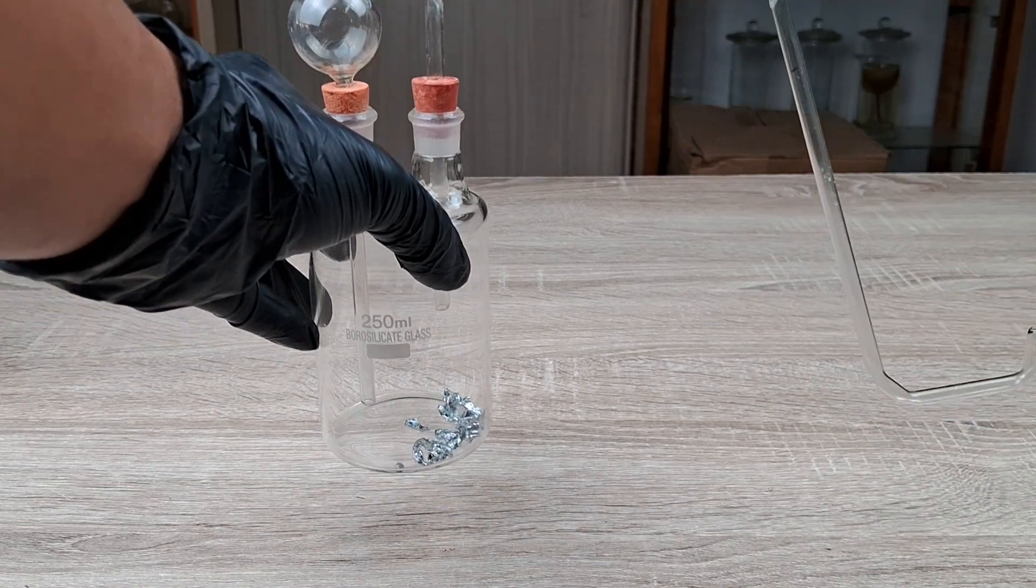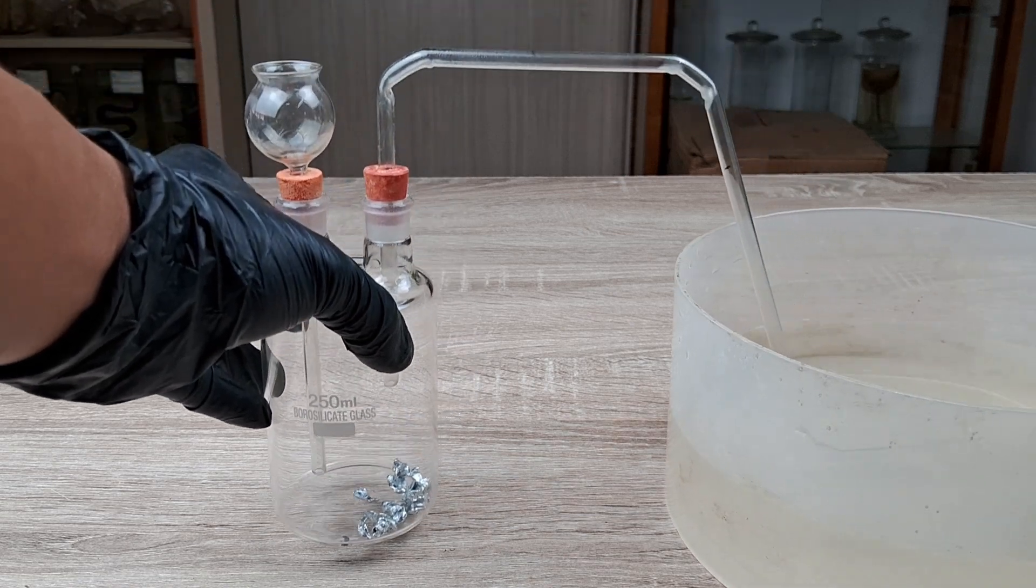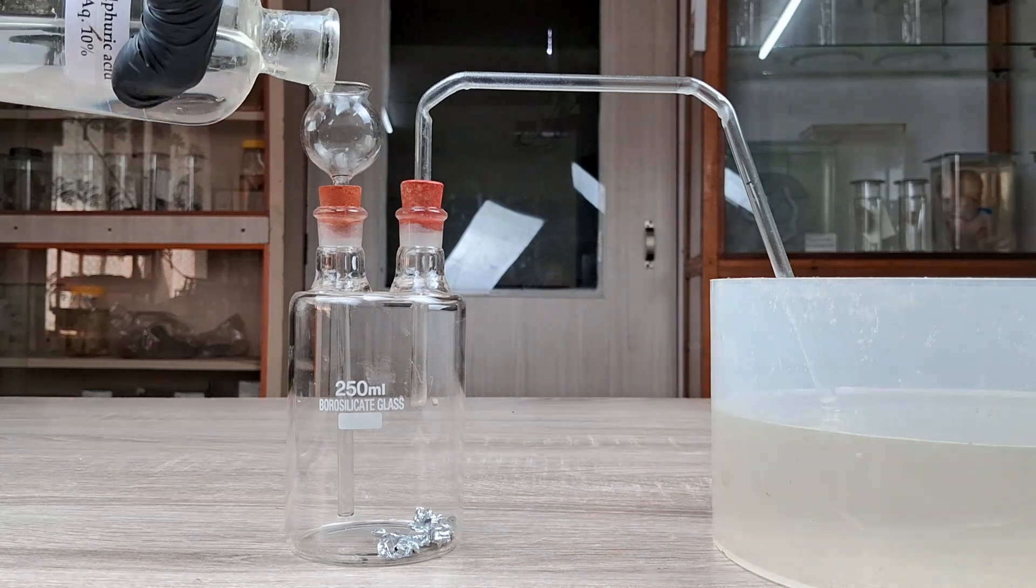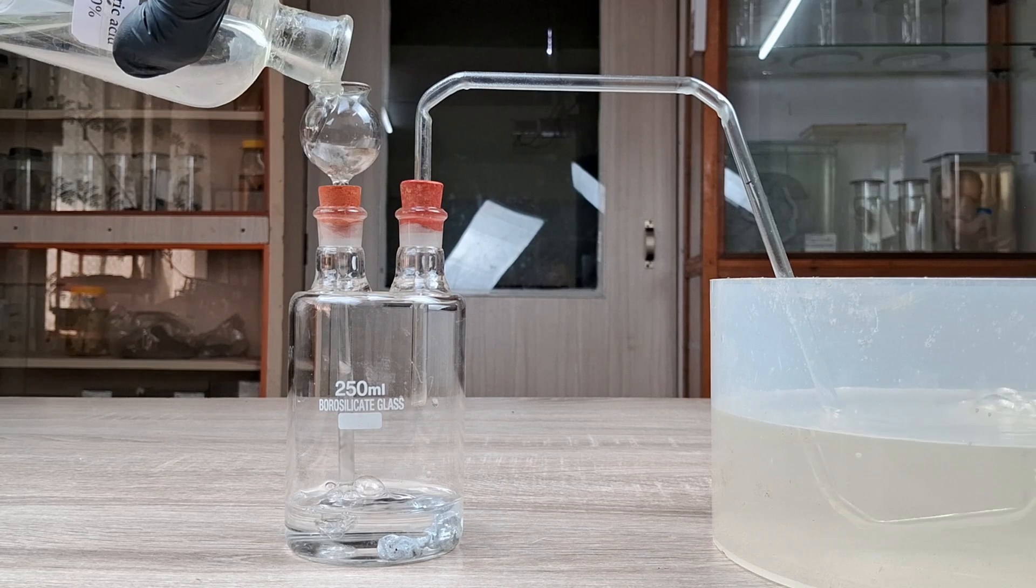Immerse the free end of the delivery tube into the water contained in the trough or beaker. Now, carefully pour enough of the dilute sulfuric acid into the thistle funnel until the lower end of the funnel is submerged in the acid.